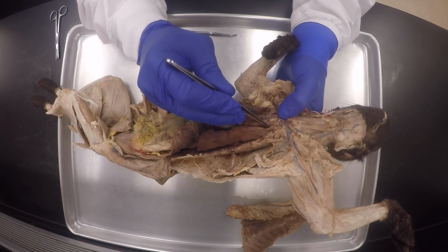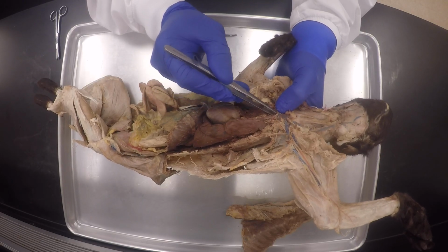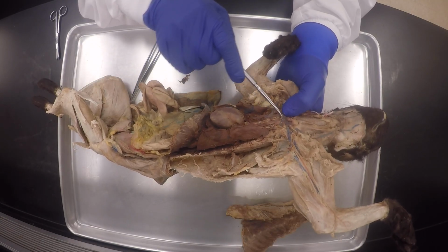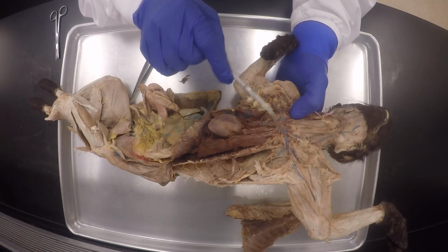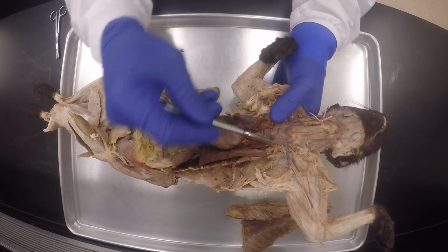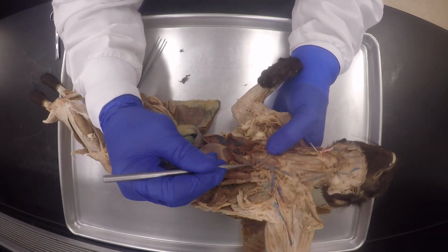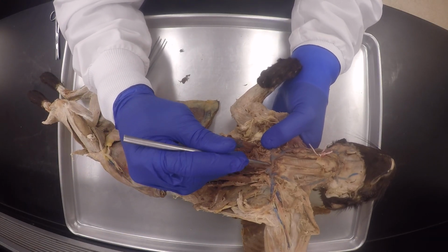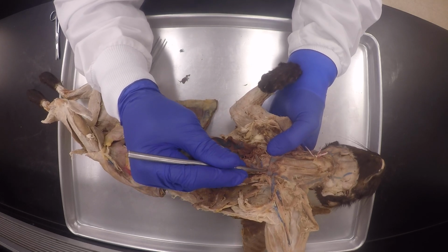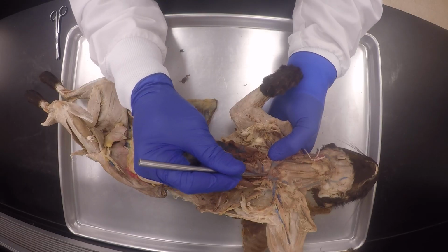And then you see the split here. This will be the right subclavian artery right here. You see what I'm saying? I scooted to this side. Okay. So there's the right subclavian. Do you see, my good friends?